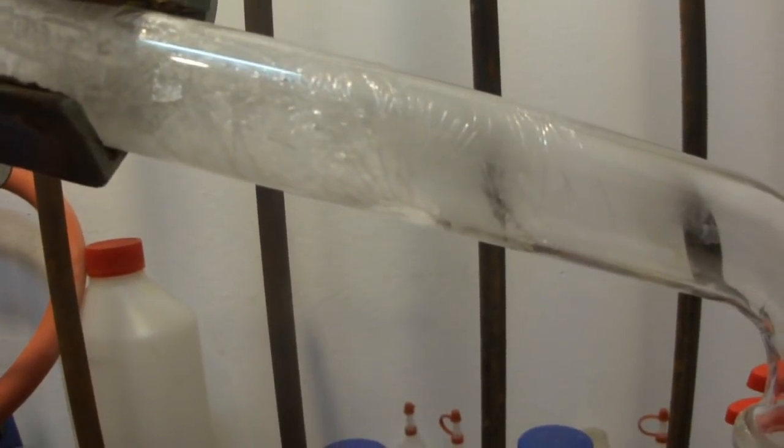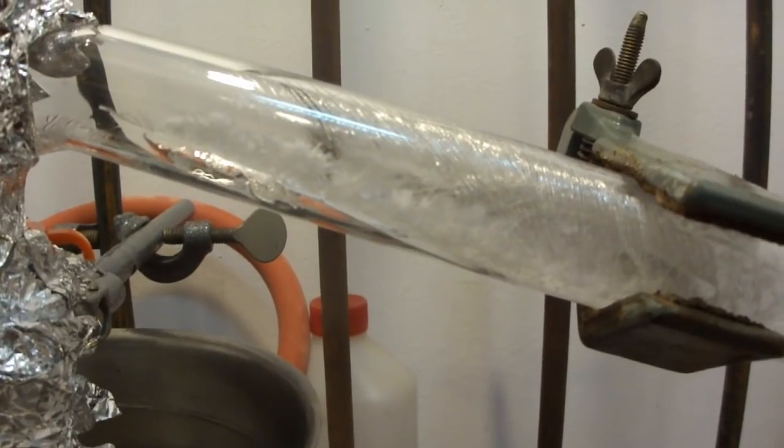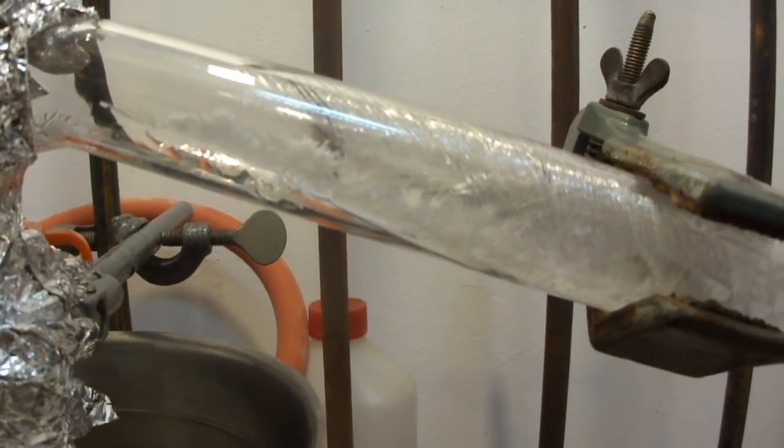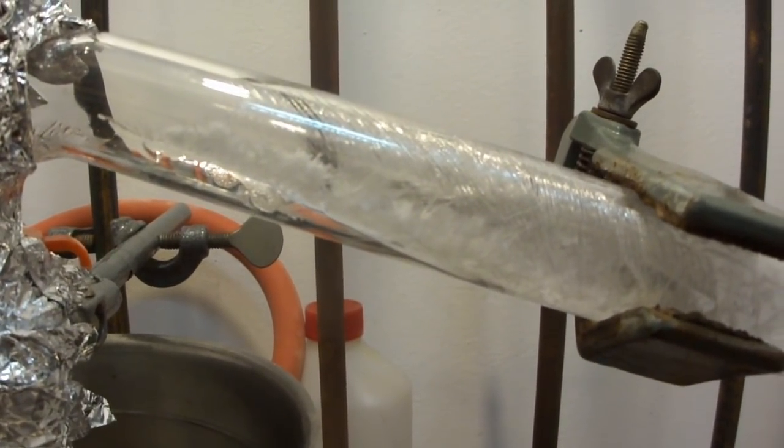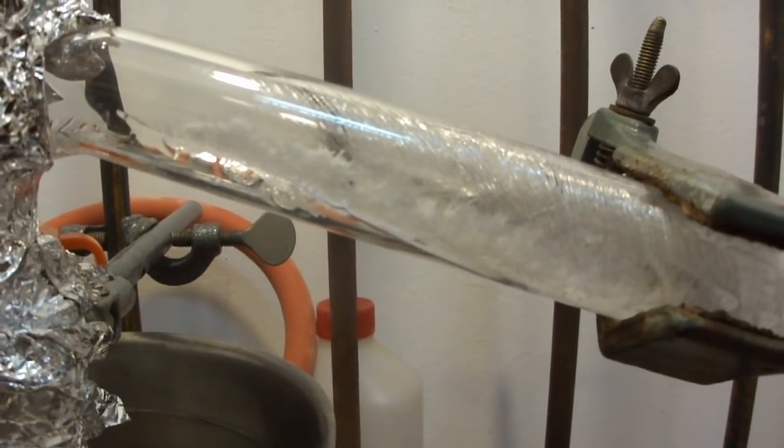And of course, when you get nice crystals like this, it is also an indication of the purity. So most of the times, the larger the crystals, the more pure the compound.